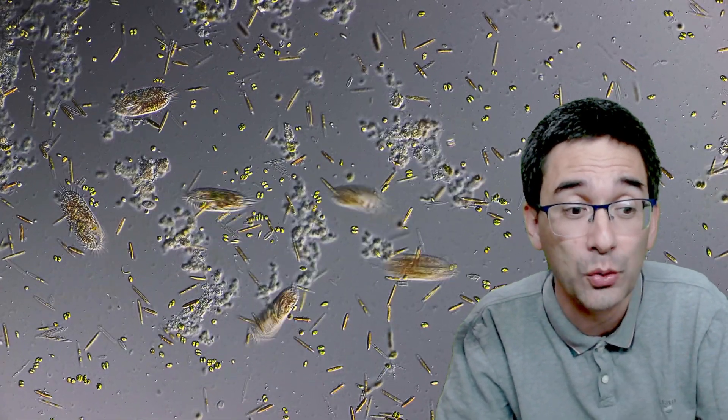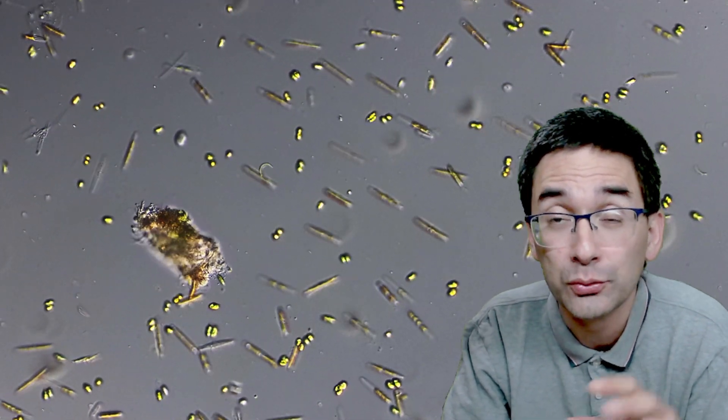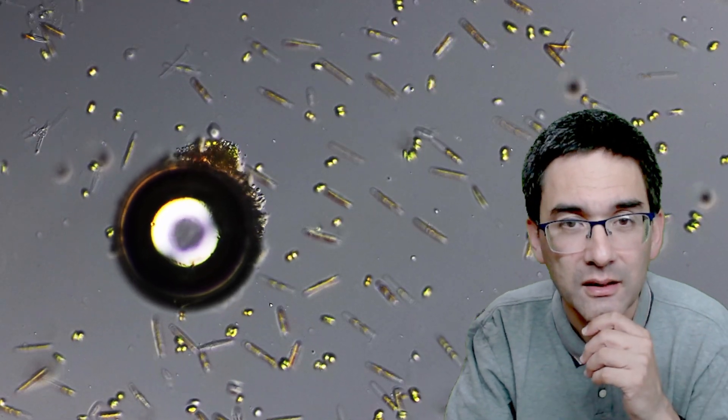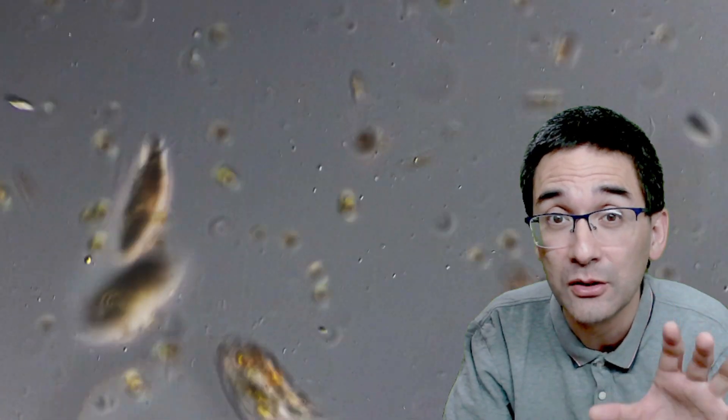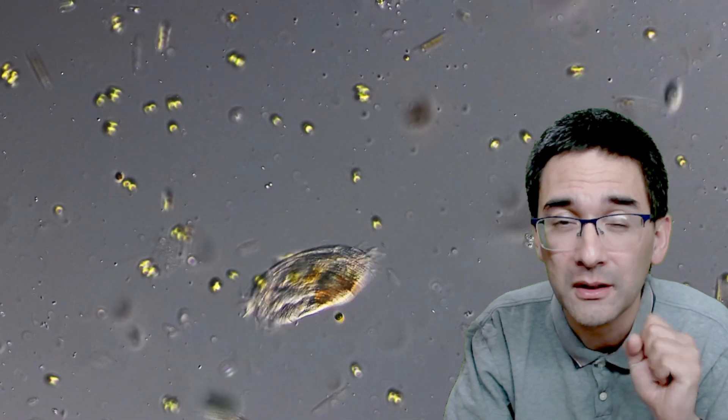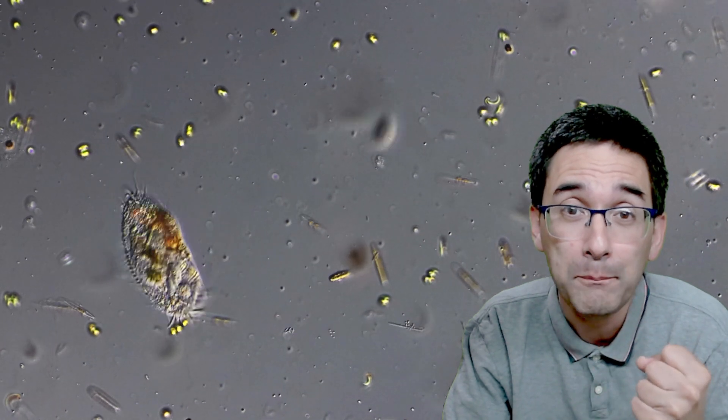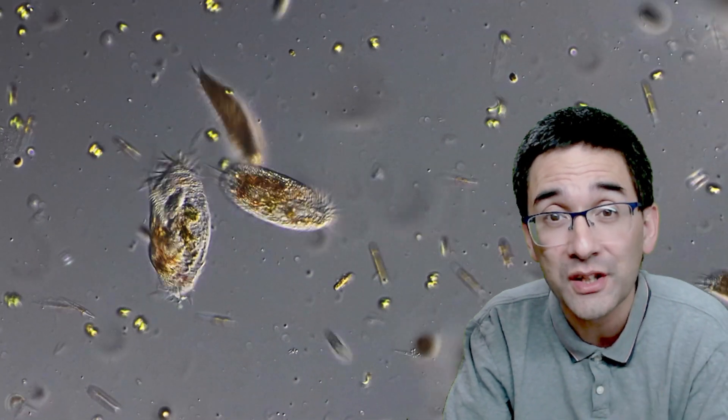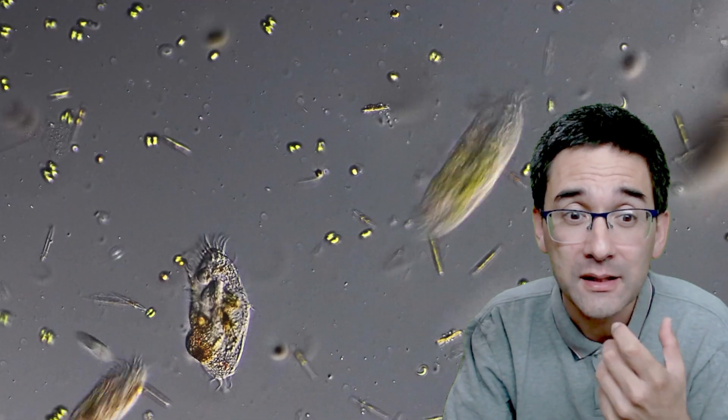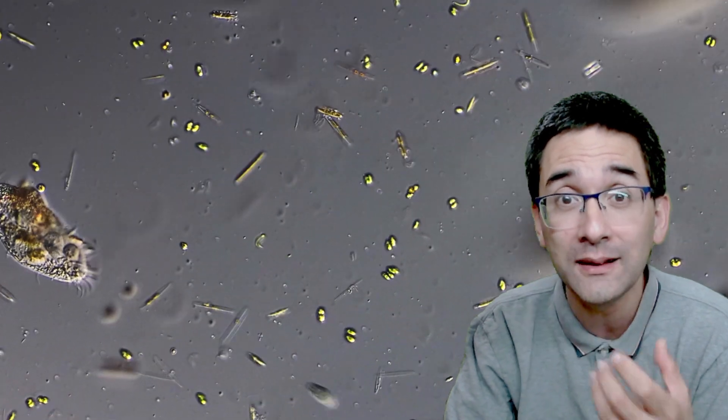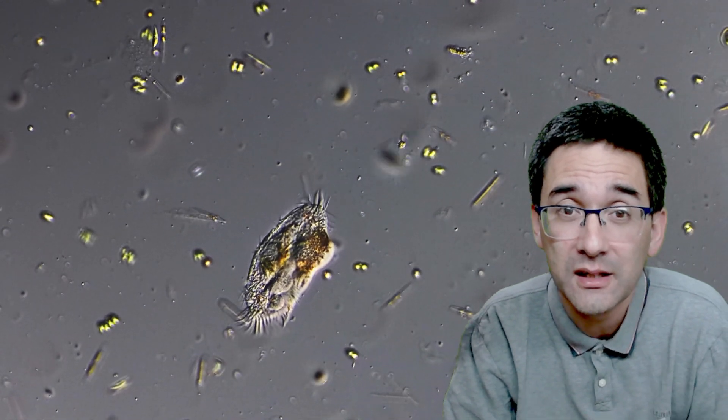What's going to happen when the hydrogen peroxide touches those ciliates? Here's one in close-up. The hydrogen peroxide reaches them and look at this—an oxygen bubble forming. This is in real time; I did not increase the speed. Sometimes these oxygen bubbles form because the hydrogen peroxide is broken down to oxygen and water. It's very reactive, and some cells contain an enzyme called catalase that breaks down the hydrogen peroxide. Sometimes quite spontaneously those oxygen bubbles start to form.